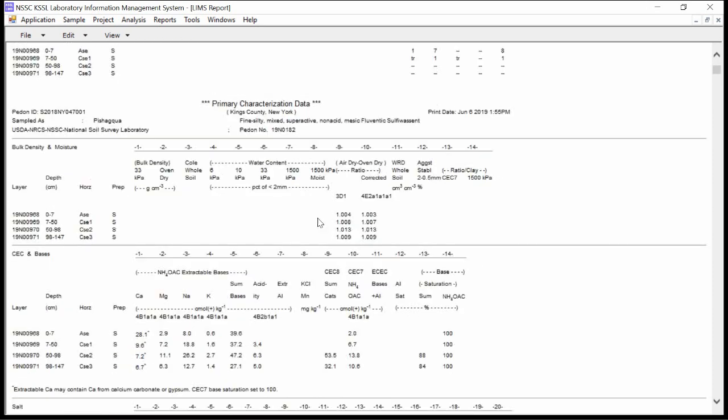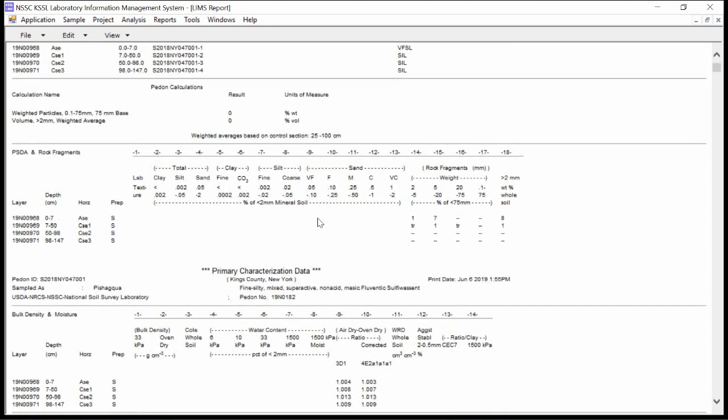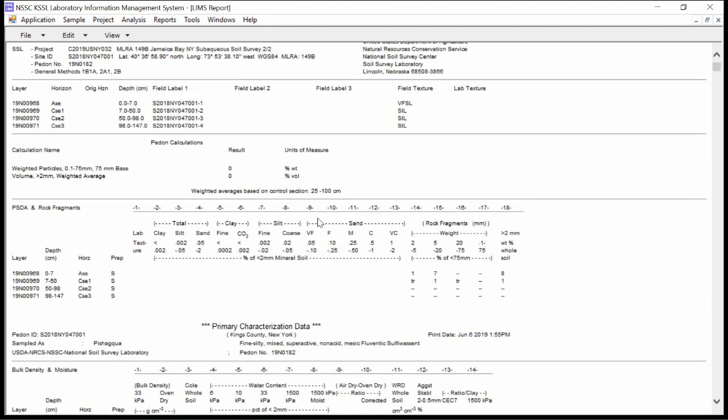In order for those to be filled in, the project status would have to be set to what? Any status. Yeah, it's probably going to be active or in progress. But that's the access that you have as a liaison that the submitters don't. This will not show up at the website until it's completed. Then the submitters can go online and do it. But meanwhile, if you see that it's 50% done and you want to generate partial data to give to them, then you can do that through LIMS at any time, even if it's still in progress.